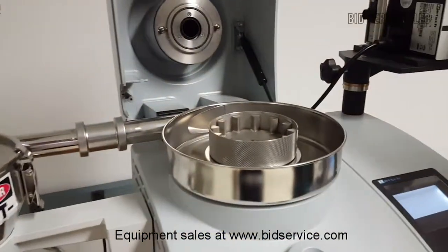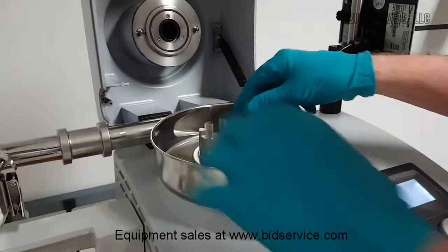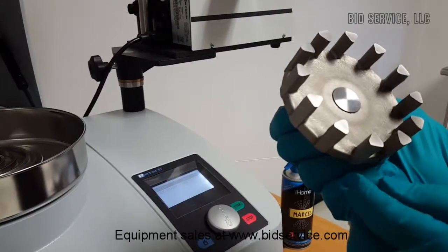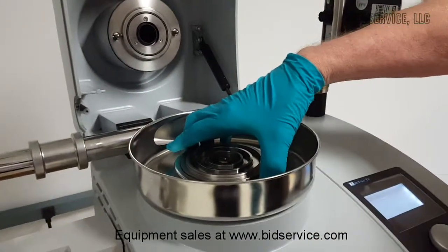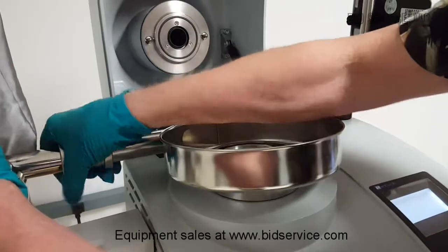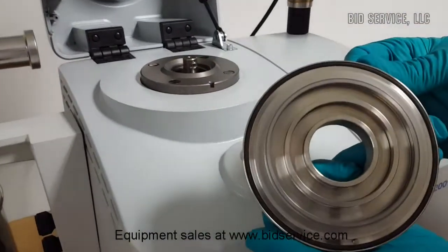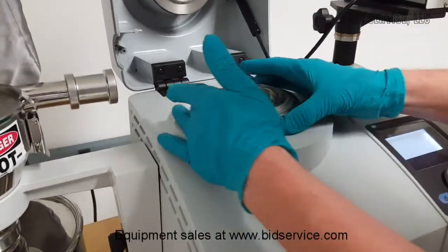First, we'll take off this cover. Then we have this grate right here. The rotor itself is available in four different configurations. This particular one has 12 lobes on it. It's also available with six and 24 lobes as well. The matching labyrinth part right here — I'll show you how that comes out. This is nice and tight so you don't lose any material. This is the labyrinth itself that fits in there. The reassembly is very simple, so you can clean this very easily. It's pinned in place.